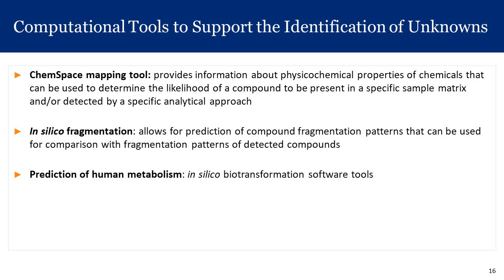Another important aspect is what is called in silico fragmentation. So this is basically using computer software to predict the fragmentation of a compound. In addition to the detection of the masses of ions using high resolution mass spectrometry, the fragments provide important information about the chemical structure.